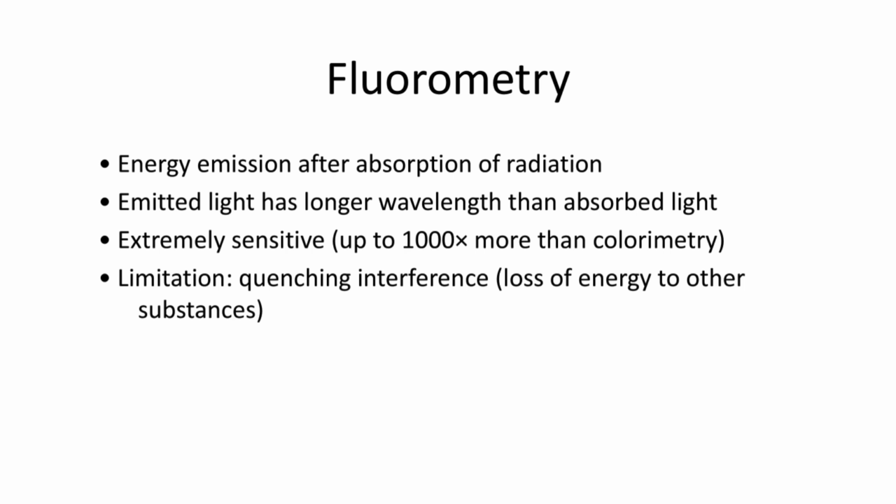Fluorometry is extremely sensitive, up to 1,000 times more sensitive than colorimetric methods. However, it has a disadvantage: quenching interference. Quenching occurs when the excited molecule interacts with another substance in the solution and loses some of its energy instead of emitting it as light.